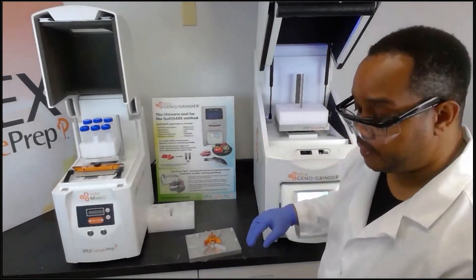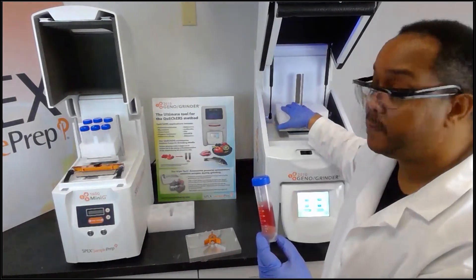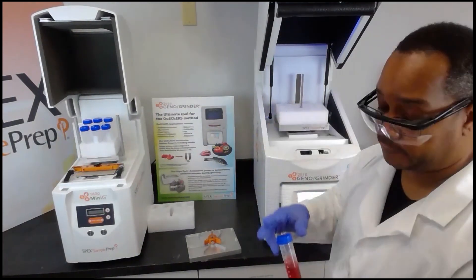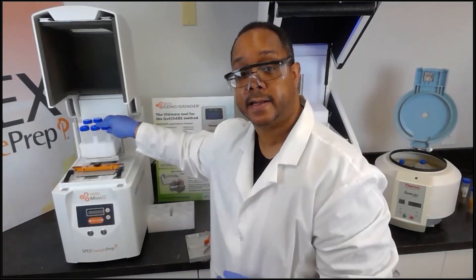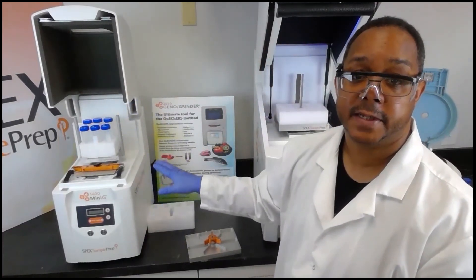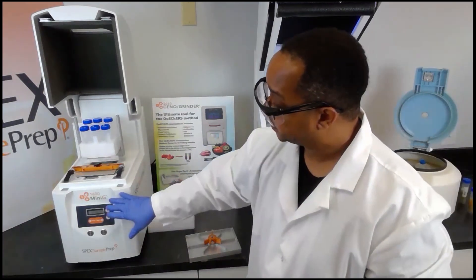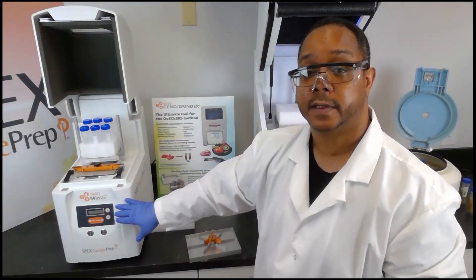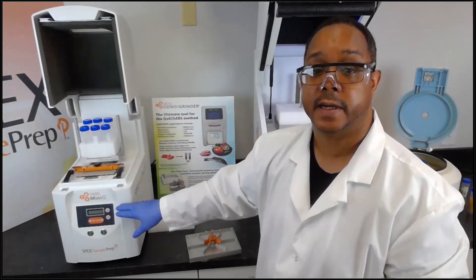In the GenoGrinder you can run sixteen 50 milliliter tubes, whereas in the Mini-G you can only run six. The speed and time parameters can be set just as with the GenoGrinder, but the difference is the Mini-G has a much simpler control panel with no touch screen — you can only set the time and the rate.